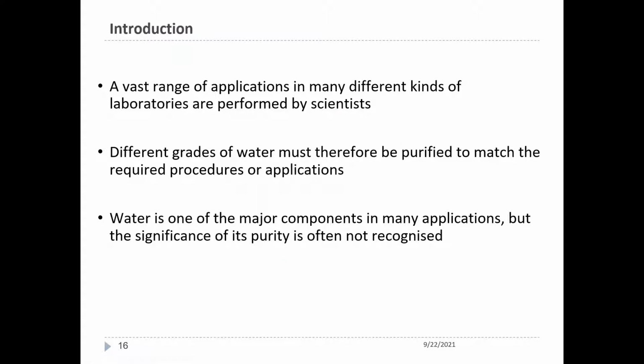As you know, water is considered to be the biggest reagent in the laboratory. Just imagine a laboratory without water. I don't think we can do any analysis in the lab, be it dissolving any substance or washing of glassware. Because of that, we also need to understand that there are different qualities of water required for specific applications.